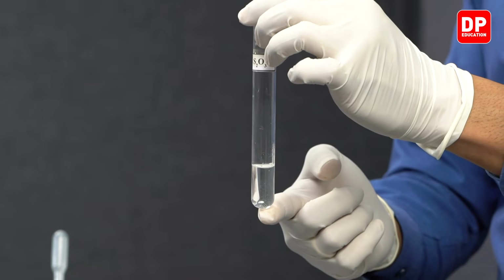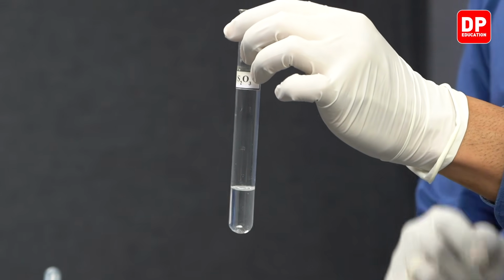And as you saw earlier, silver sulfide is a black color precipitate, and as it turns into silver sulfide, you will observe a little bit of a brown color in the medium as well. However, the final product that is going to be formed is silver sulfide, which is black in color and it is water insoluble. So we'll observe silver sulfide getting collected at the bottom of the test tube.